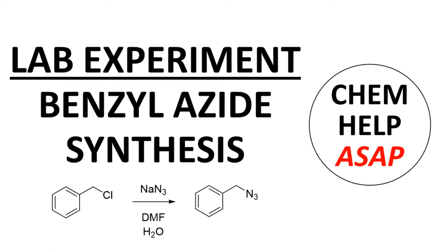Hello from Chem Help ASAP. In this video, we'll perform an SN2 reaction of sodium azide as a nucleophile onto benzyl chloride as the electrophile to form benzyl azide, our title compound.